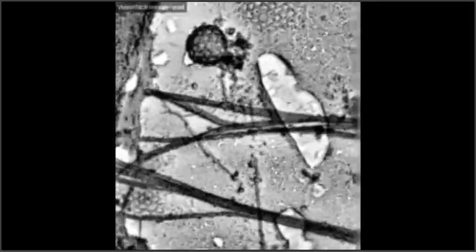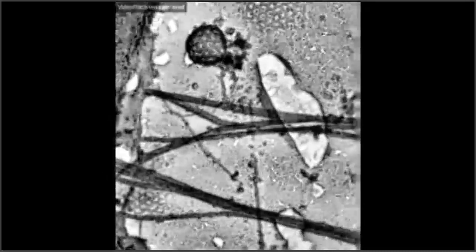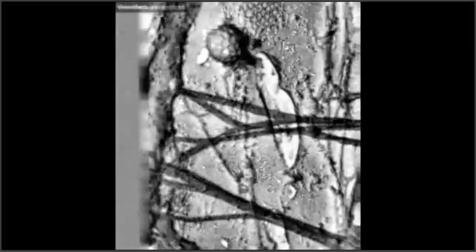Yeah, that has a sort of cage pattern to it. And you can see another one just up to the right of it forming in another patch just off to the side. But in addition, you'll see a whole bunch of black dots next to it. That's an actomyosin complex that's there to help pinch that bud off from the plasma membrane. And you can see little tiny dark spots off these large strands, which are the microtubules. Those are motor proteins staged there to capture that clathrin-budded vesicle to bring it to wherever it's going to go in the cell. So I can see why you're saying this is more art, because of the effort involved in making something like this.